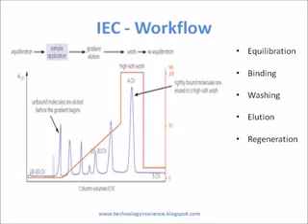For the best results, the composition of the eluting buffer is changed as the elution progresses. The change is usually a change in ionic strength, from a more dilute to a more concentrated buffer, or, less frequently, a change in pH. This elution process is called gradient elution, and this generally gives a much better separation of solute.